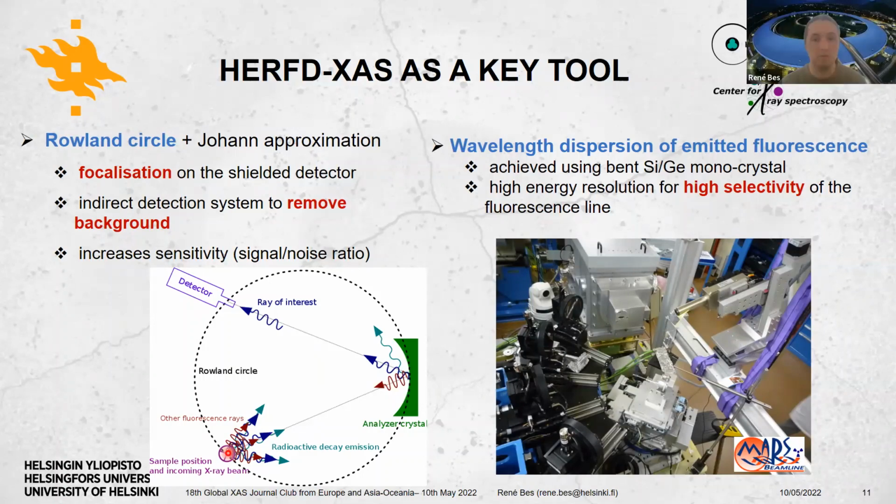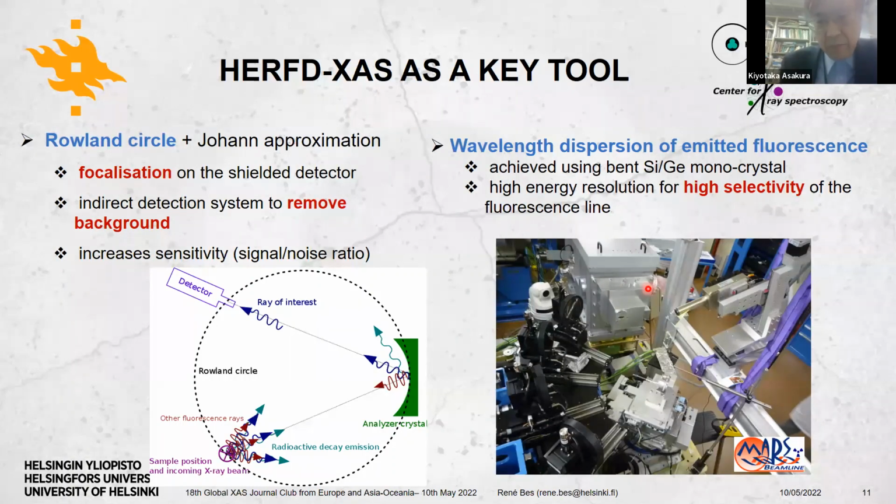Sealed? No, it's not so special. This one is just a detector. It's just state-of-the-art detectors. Typically, the ones which have a resolution at the K-alpha of manganese of 140 eV, something like that. Yeah, something like that. So not so special, it's a usual, normal SDD. Sorry, silicon drift. Yeah, exactly. Okay.